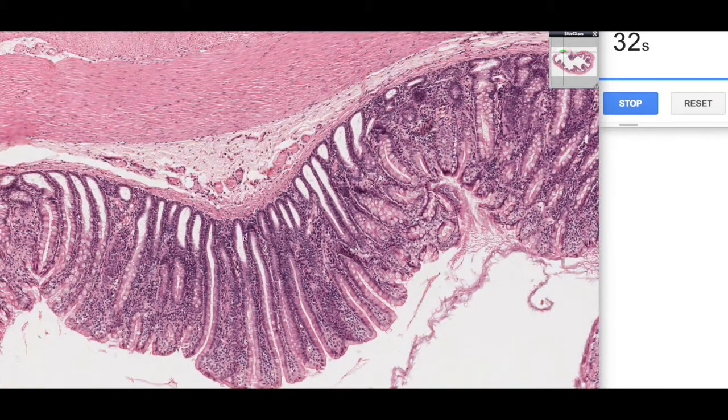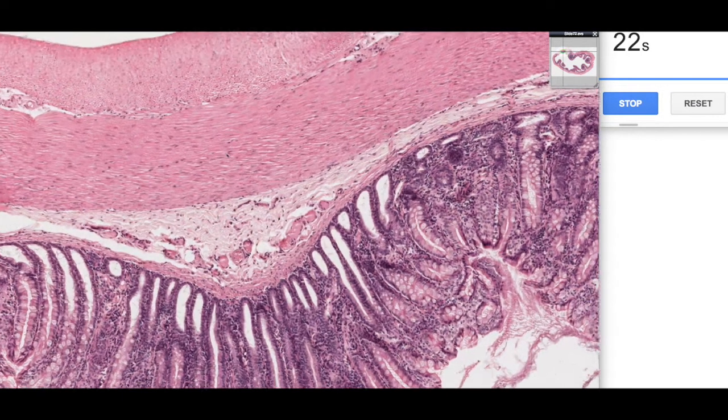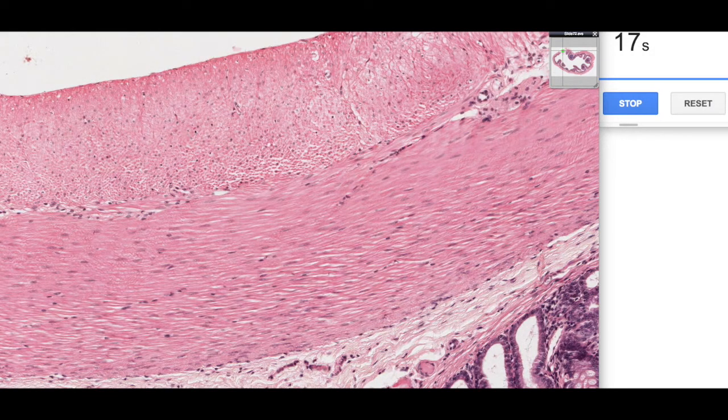We zoom out a little bit, we can still see our muscularis mucosa here, a smooth muscle. Here's our submucosa, and then out here we have our two layers of tunica muscularis: an inner circular layer, and as I mentioned before, an outer longitudinal layer, which in humans would be three bands of the tinea coli.